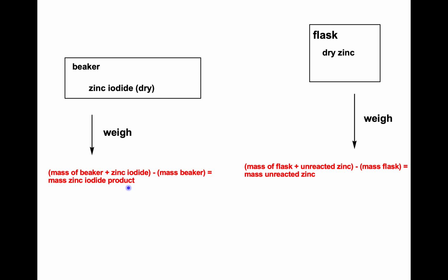So there's 2 notes in your lab notebook about how to be sure that you've completely removed the methanol. One is that a good sign that you have a dry solid is if it moves freely when you rotate the flask. If it's wet still, there's still methanol, it will coat the edges, but as it dries, then as you roll the flask, it will move at the bottom. You've seen this with oatmeal. Dry oatmeal moves quite easily in a bowl, but once the oatmeal gets wet, you'll see then it sticks to the sides.